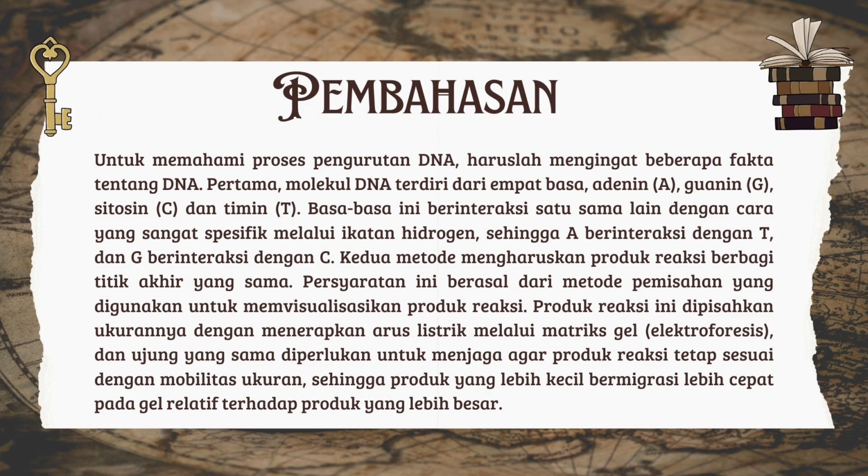Persyaratan ini berasal dari metode pemisahan yang digunakan untuk memvisualisasikan produk reaksi. Produk reaksi ini dipisahkan ukurannya dengan menerapkan arus listrik melalui matriks gel. Dan ujung yang sama diperlukan untuk menjaga agar produk reaksi tetap sesuai dengan mobilitas ukuran, sehingga produk yang lebih kecil bermigrasi lebih cepat pada gel relatif terhadap produk yang lebih besar.